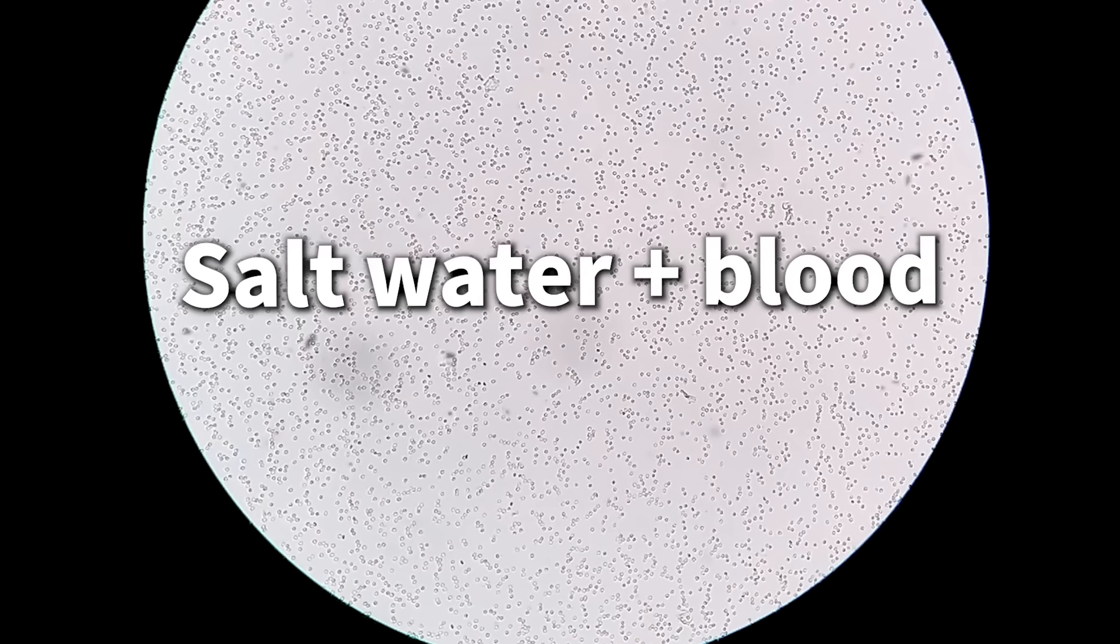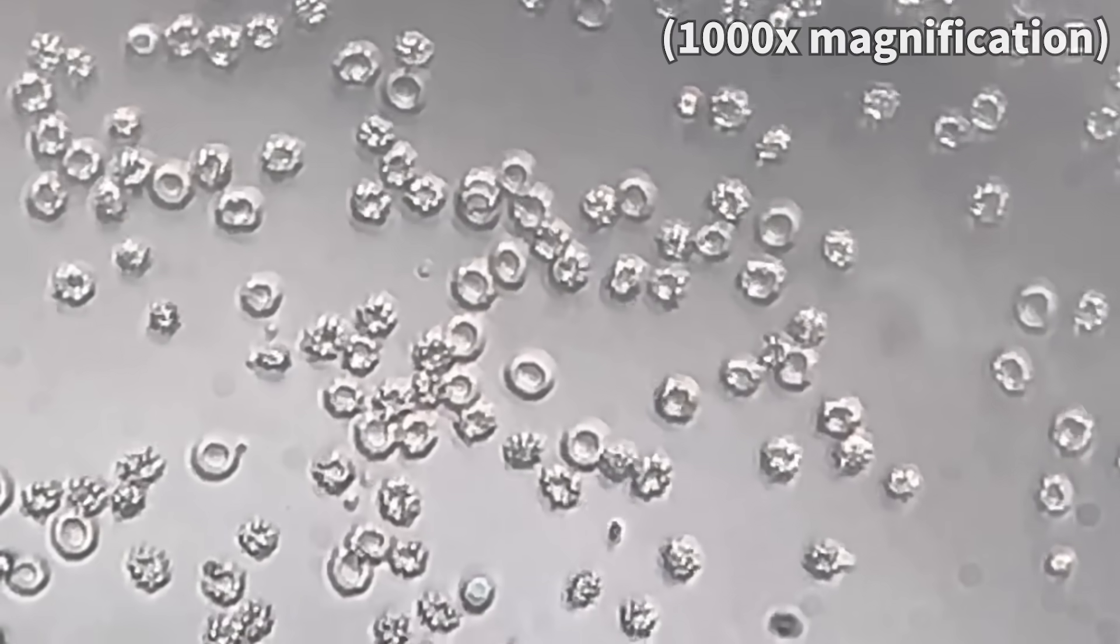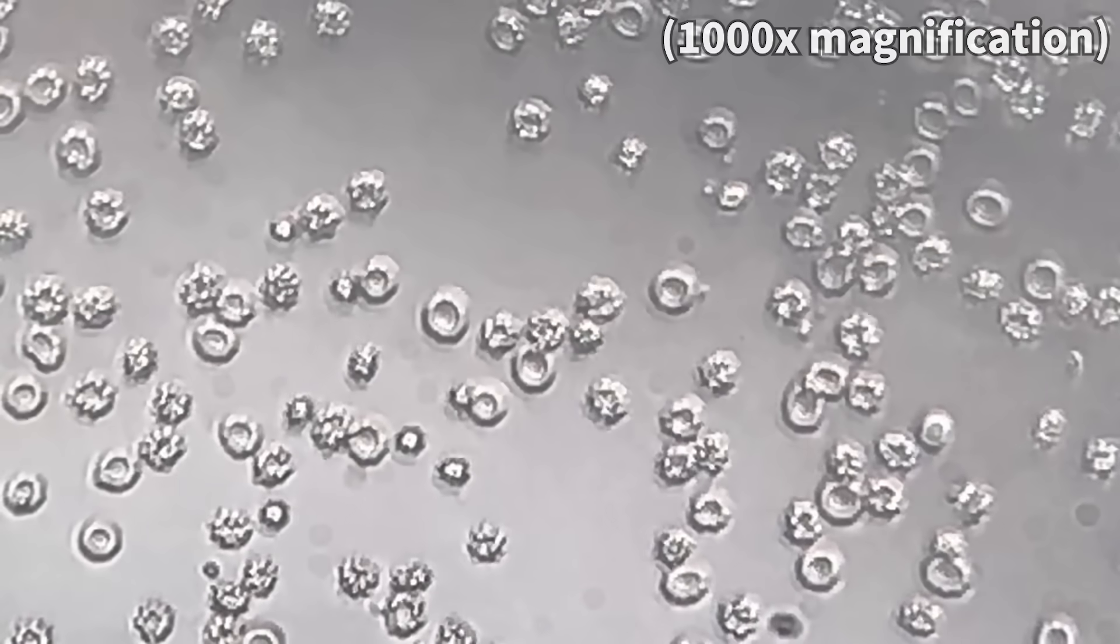But with the blood mixed with salt water, notice something? The red blood cells have shrunk, resembling pointy sugar candies. Isn't that shocking?